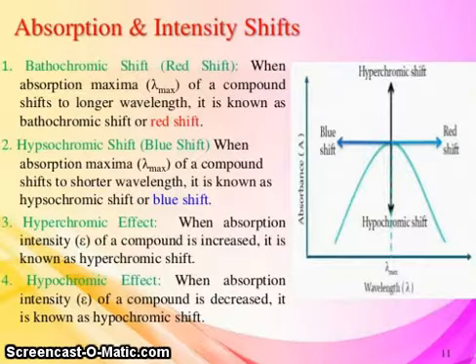Now friends, absorption and intensity shifts. You can see the hypochromic shift, hyperchromic shift, red shift and blue shift.